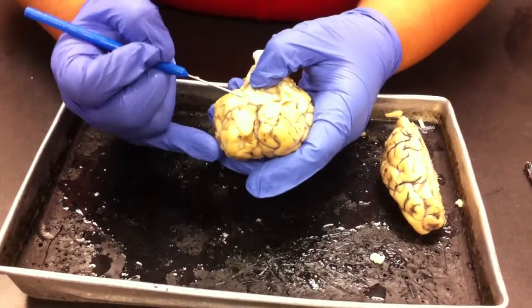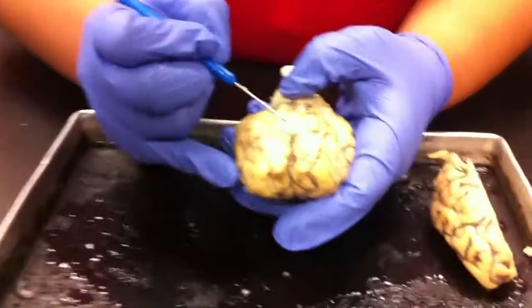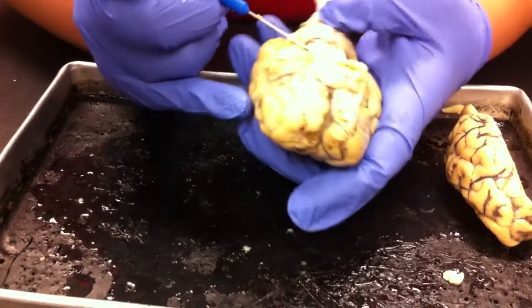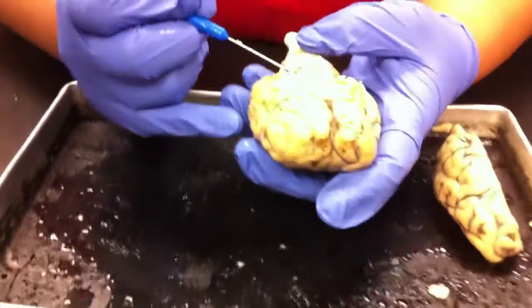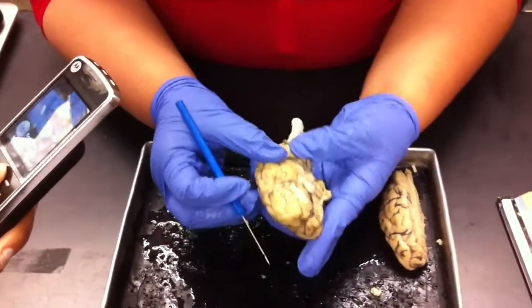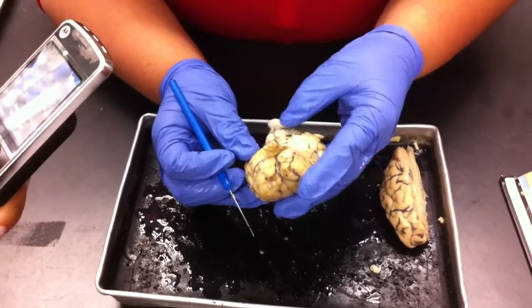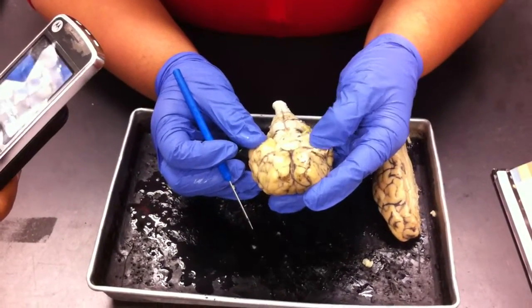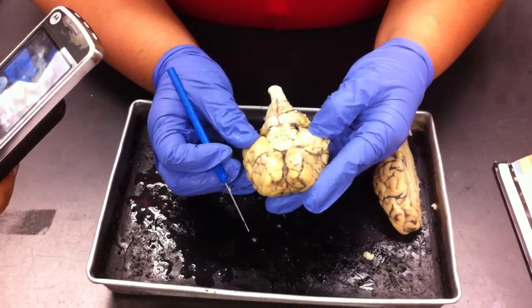There are the stubs of the optic nerve and the optic chiasma right here. This one coming alongside from the center is the abducens. Those are the ones we can see clearly here. For sheep, their olfactory and optic nerves will be extremely large, so don't be surprised.